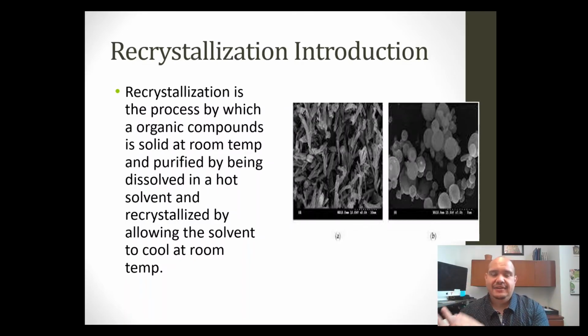Recrystallization is taking a crystal that's crude and recrystallizing it with the intent of removing impurities for the sake of purification. Crystallization is just taking a solute, dissolving it in a solvent, and then crystallizing it again with no impurity being excluded. That is what crystallization is.